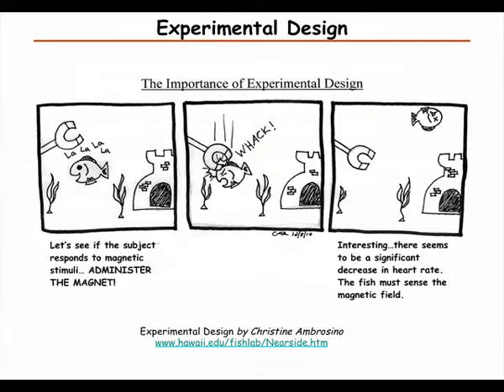But before we talk more about molecular markers, I'm going to talk a little bit about experimental design, because as we'll see later on, a lot of times the experiments to discover molecular markers are not so well designed. It's surprisingly easy to go wrong with experimental design. As you see, this is a cartoon that shows one example, but it's quite difficult to really think through all the steps in experimental design.